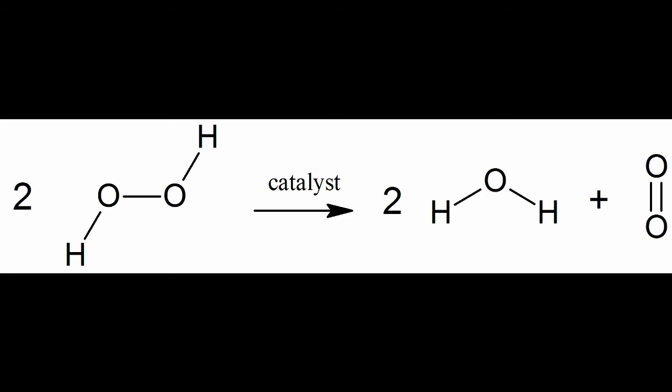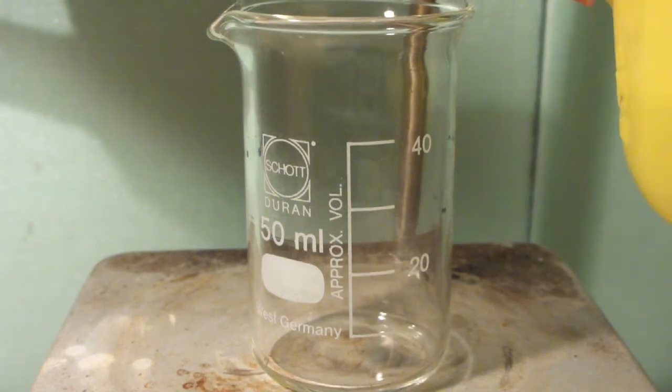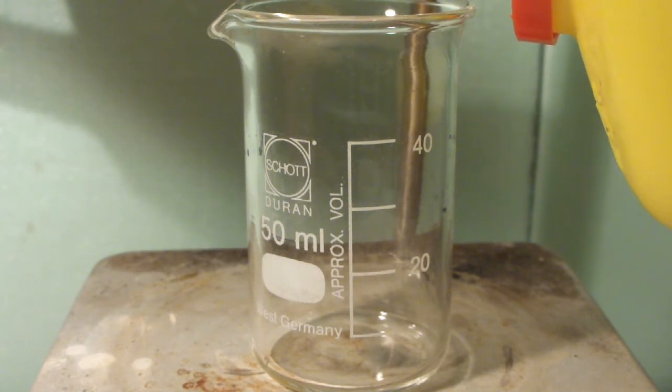From a certain concentration onwards, the decomposition can also happen explosively. We are now going to use platinum as the catalyst to decompose the hydrogen peroxide. Let's add some 35% hydrogen peroxide to a beaker.